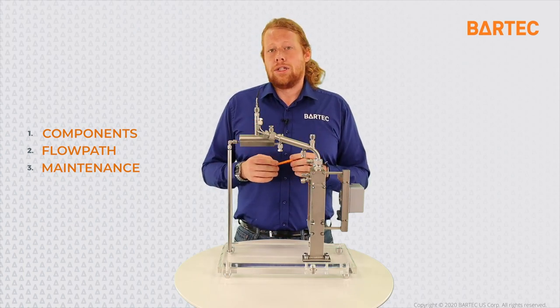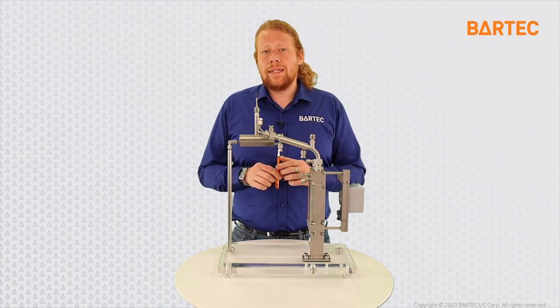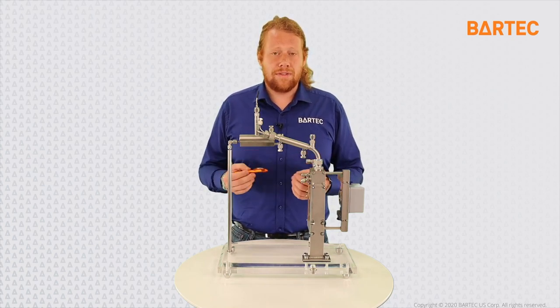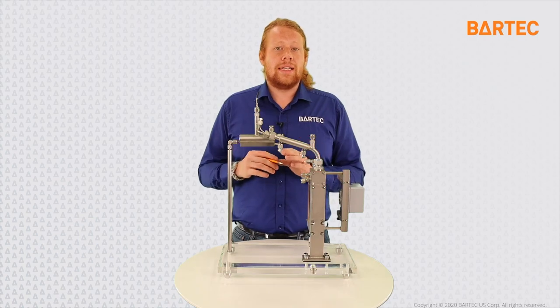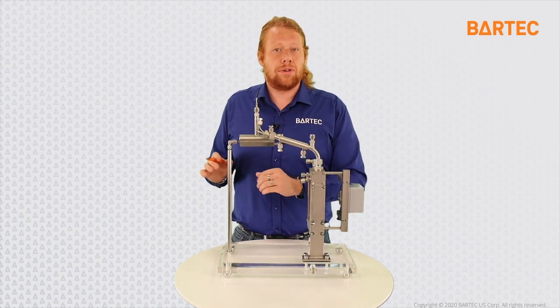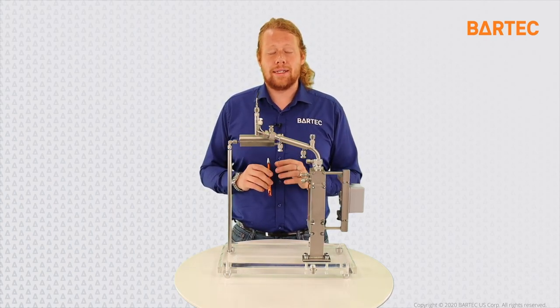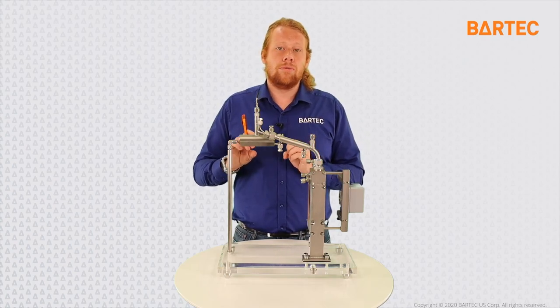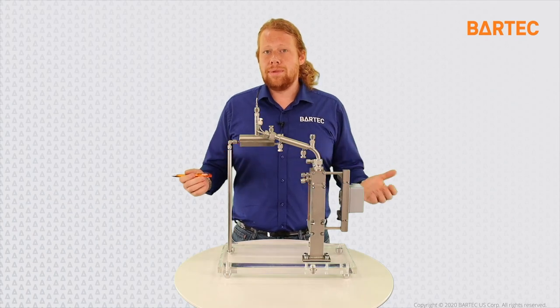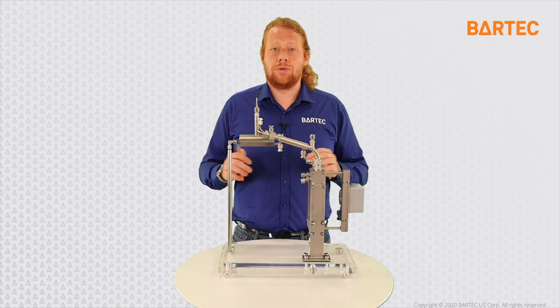All right. So what is the difference between a rapiDist-4 and a DPA-4? Well, basically, they're both built with the ASTM D86 philosophy in mind. The big difference is one is correlative, the rapiDist-4, the other one, the DPA-4, the distillation process analyzer, is compliant to the ASTM D86. And this has mostly to do with the sample size and therefore the speed of the measurement.